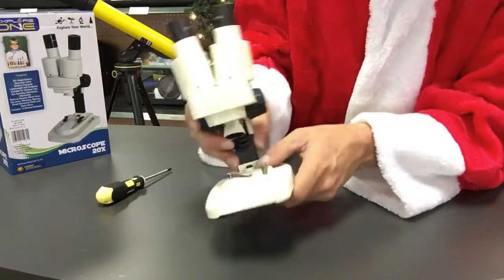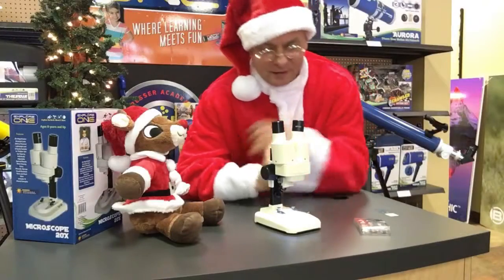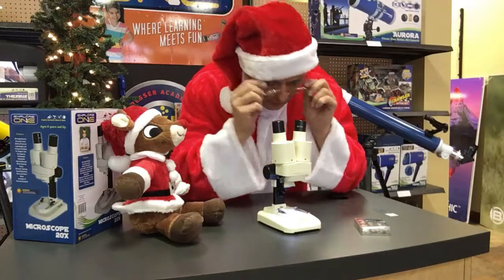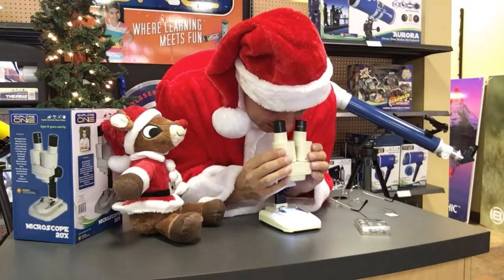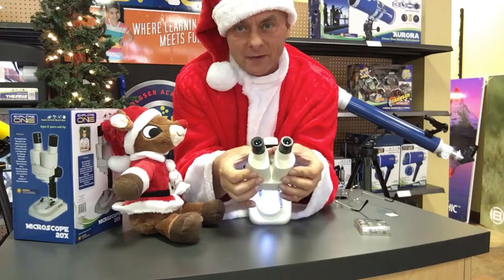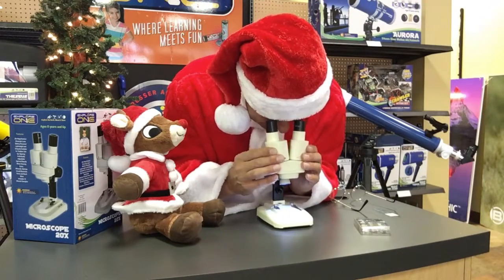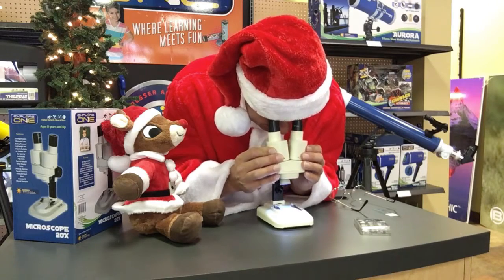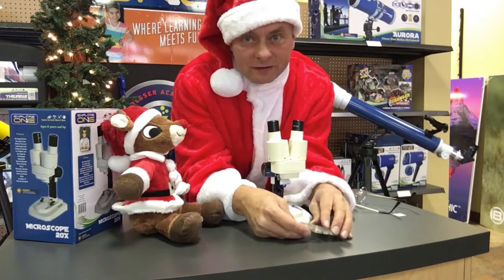Now we can press this button and the light lights up. So how do you use it? It's pretty easy. All you have to do is take your glasses off if you wear glasses. And then you've got this adjustment here — see how the eyepieces can spread apart. All you've got to do is look down into it and spread these apart until you see a nice sharp circle. And inside that circle is the viewing field.